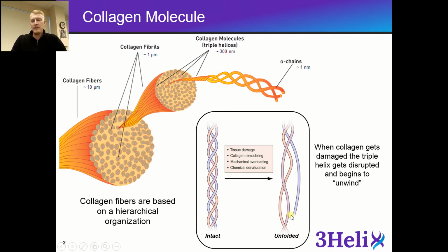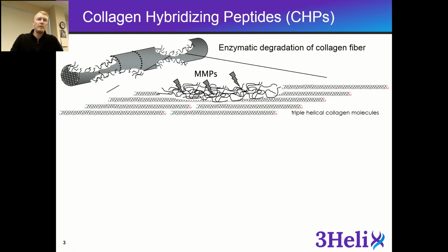However, it can be unfolded and start to unwind if it gets damaged due to collagen remodeling, mechanical overloading, chemical denaturation, or even enzymatic action. So what we did is we developed a collagen hybridizing peptide.